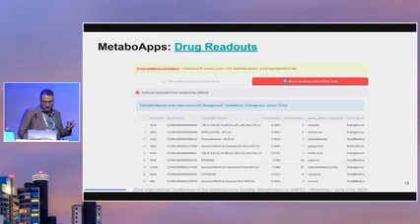But also keep in mind that for the default, the features that are being excluded are the ones based on background, in this case noise or blank samples, as low confidence, which is one of the categories we have for some of those annotations, and endogenous or food related compounds. Those are the standard ones. So if you're working with something that you already know belongs to those categories, you can already change that just before starting your analysis.